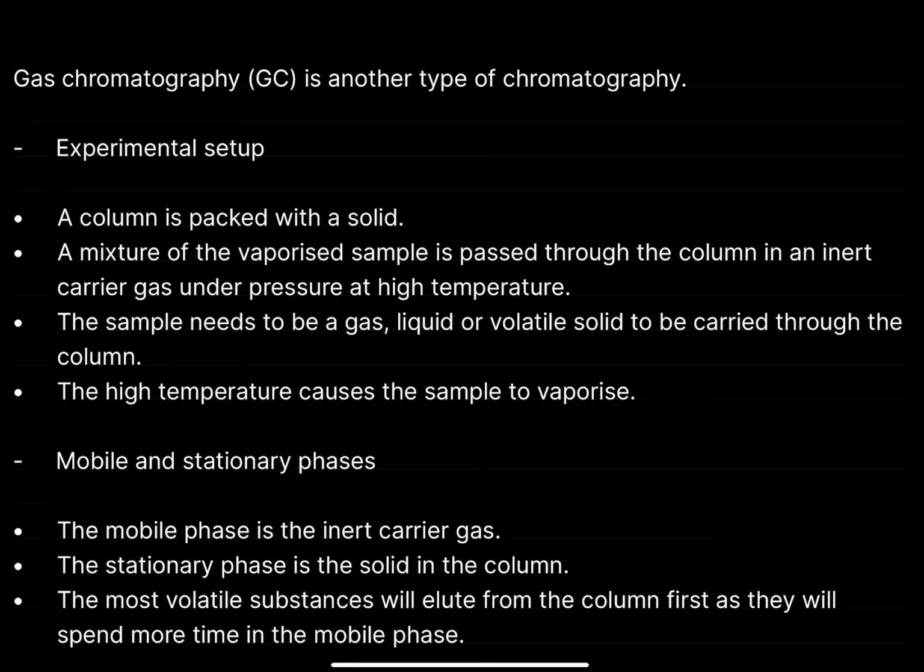You just basically have to understand, as I said in the previous two videos, have a good understanding of what the stationary phase is, and the mobile phase and the affinity. Today, the affinity isn't really based off of polarity, but mostly to do with volatility. As long as you have a good grounding of that, this will be quite a straightforward video for you.